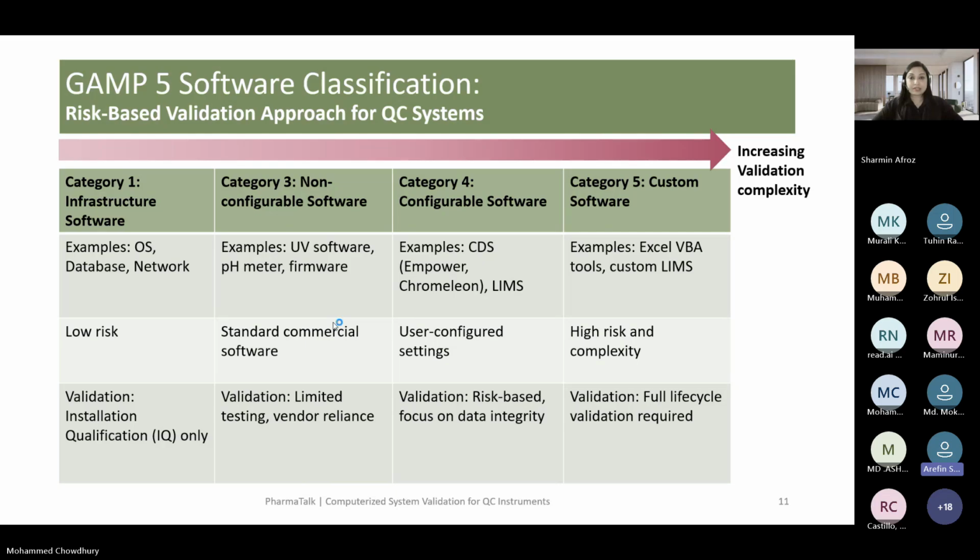When we're talking about data integrity, say you run an HPLC today, and after 10 days or 1 month you are asked to retrieve the data. You will search your own computer or the computer attached to the specific HPLC machine, but there is no server station or cloud backup.